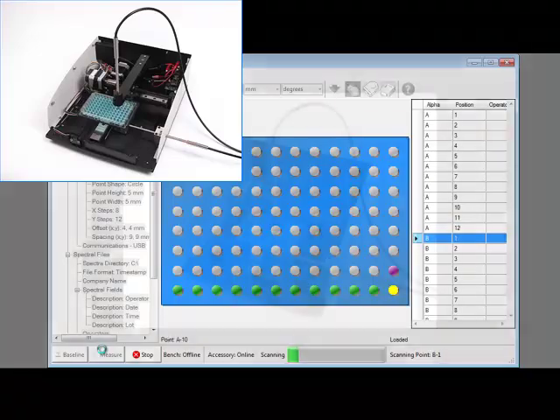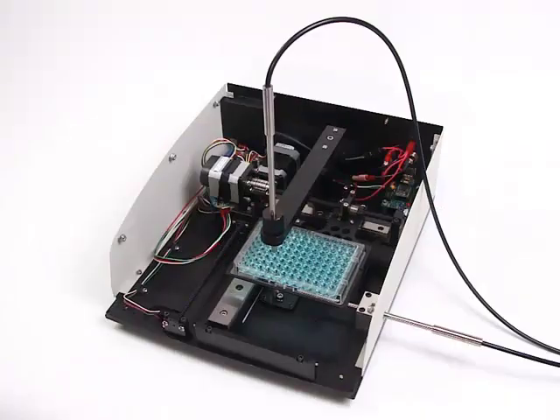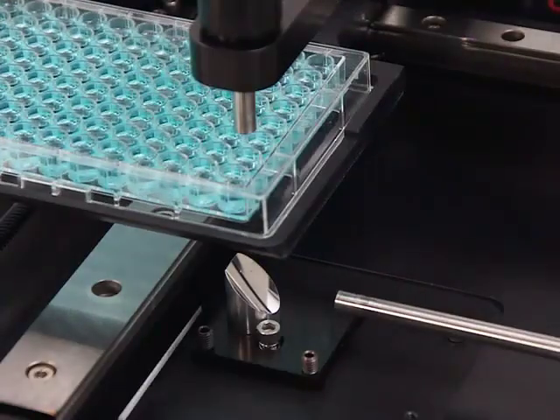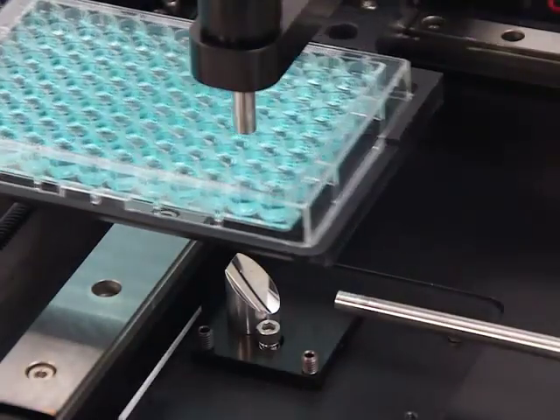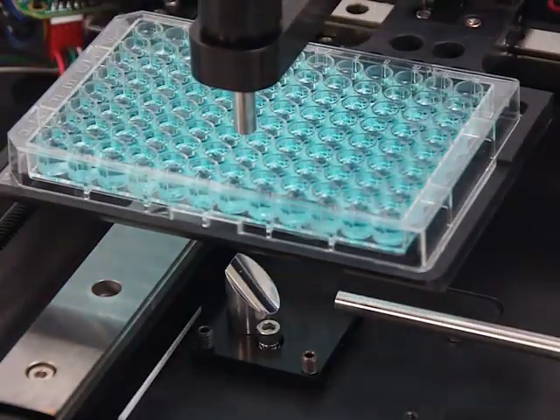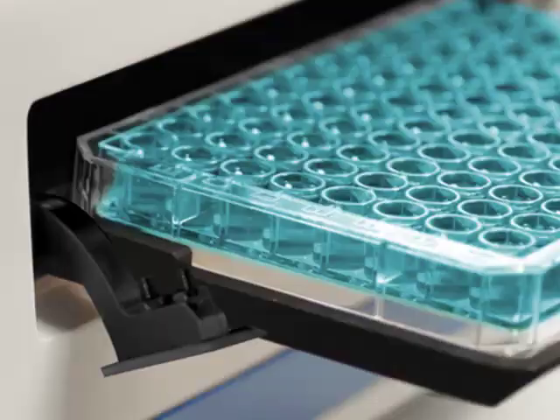The Microplate Reader measures a 96-well plate in 32 seconds, and it takes 84 seconds to cover a 384-position well plate.